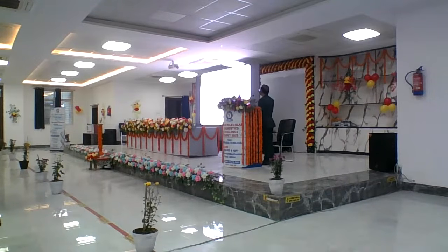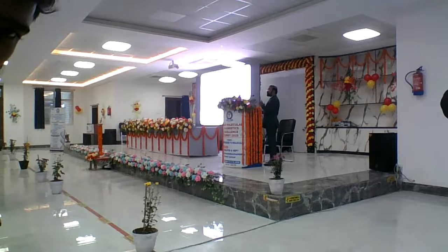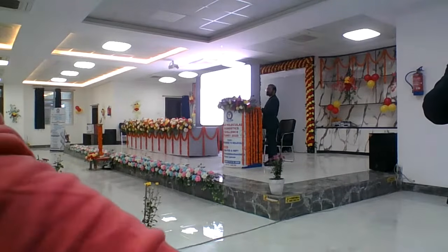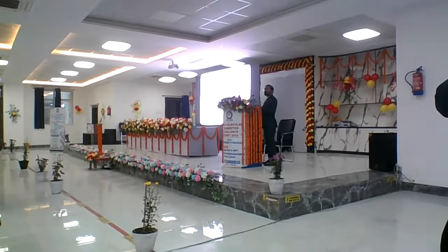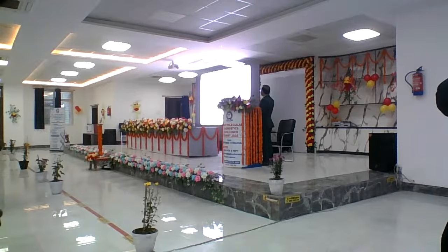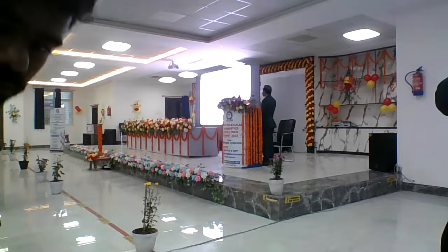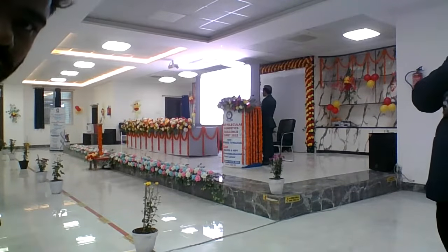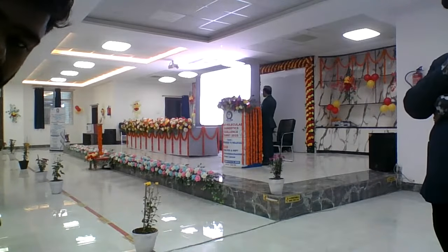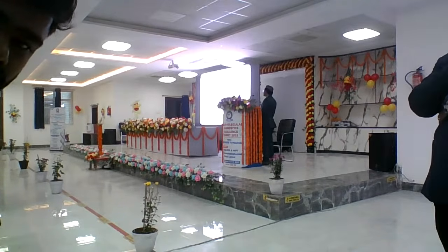Now you have to calculate the fraction of positive droplets. That is fairly easy. Positive droplets divided by the total number of droplets that you have. After that you will apply Poisson's statistics. It is done by the computer or the software itself, which helps you to identify absolute copy number.